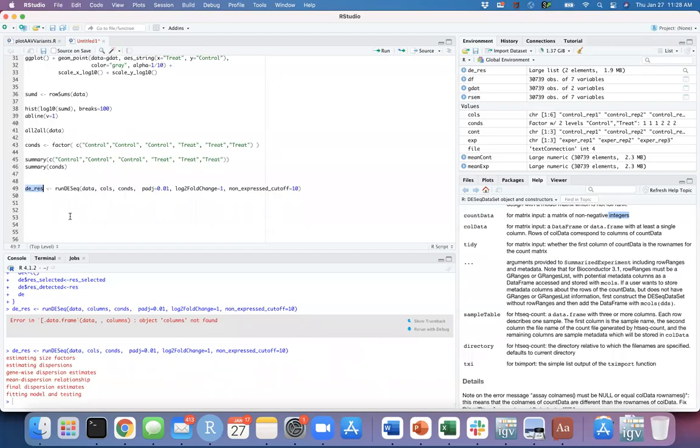So DE-RIS, if I just show you what I have in DE-RIS, if you just write it here, see, with dollar, you can see detected genes or selected genes. Those are two different data sets. Selected means it's eliminating all these things using these cutoffs and getting only significant different genes to overlay.